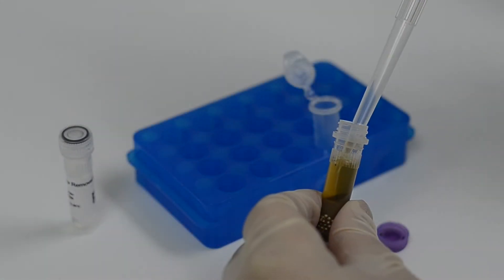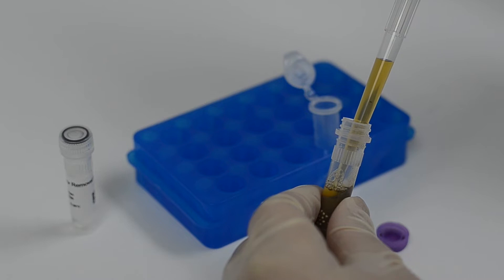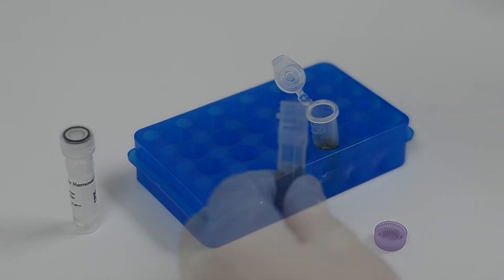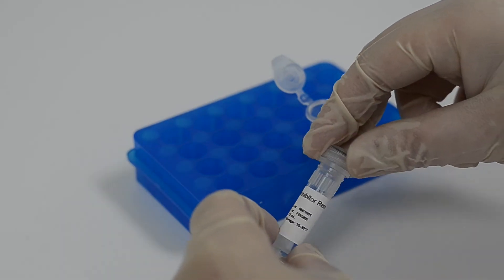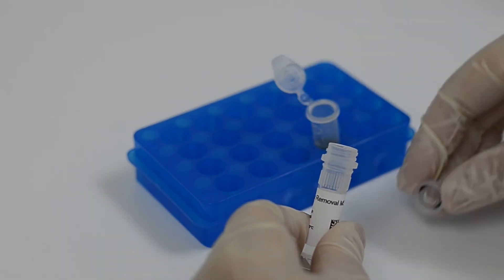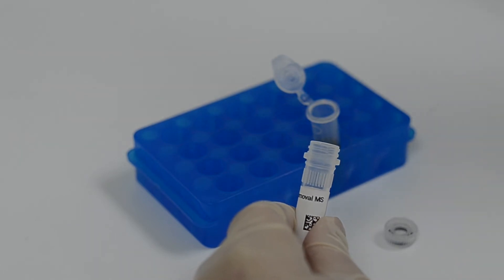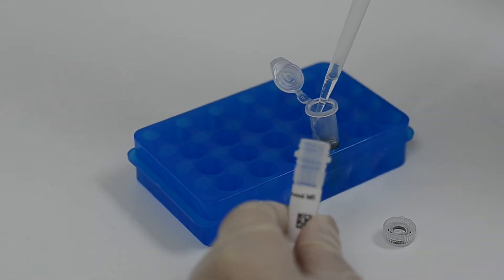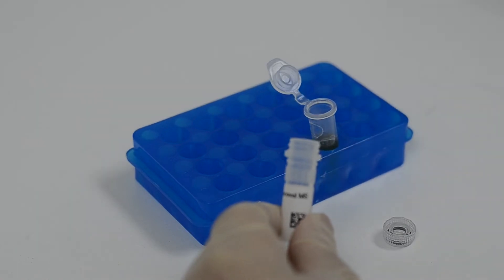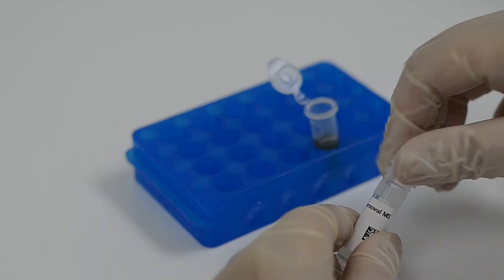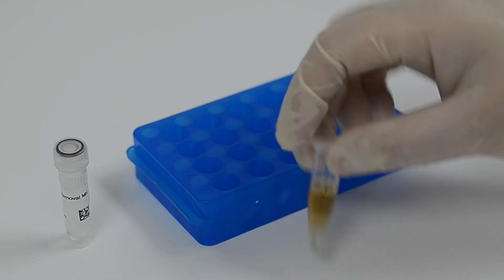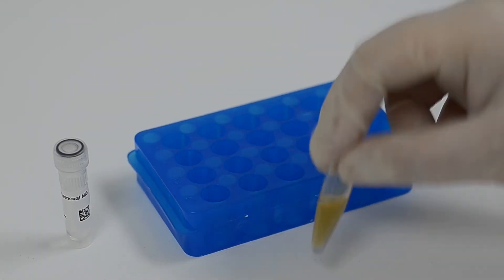Transfer 800 microliters of supernatant into a clean 1.5 ml microcentrifuge tube. Add 200 microliters of inhibitor removal MS. Mix thoroughly by inverting the tube for 20 times.